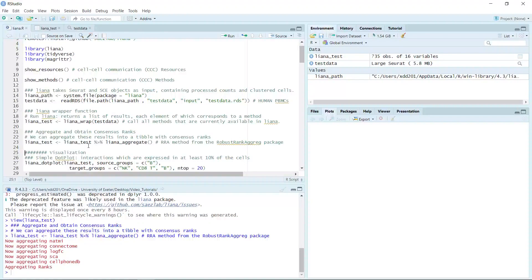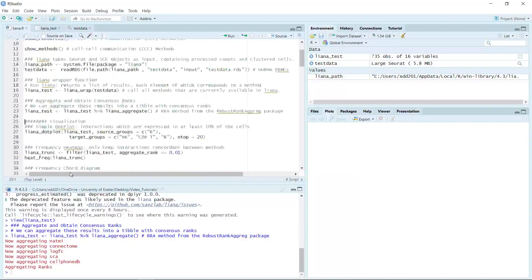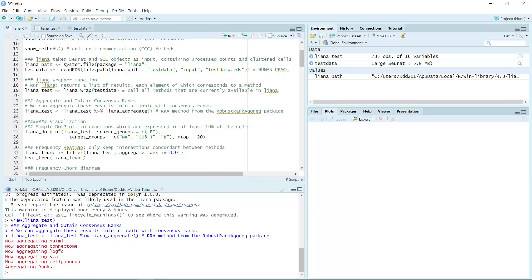It is very quick. We ran the wrap function for the five methods and aggregated the result to rank the cell signaling pathways. Now we can visualize the top signaling pathways using a dotplot, heatmap, and chord diagram. First we can run the dotplot. We are going to use the aggregate test result. For demonstration, we set the source group as B cells. We can use all cell types — NK cells, CD8 T cells, and B cells — as the target group. For the dotplot, we only plot the top 20 signaling pathways.